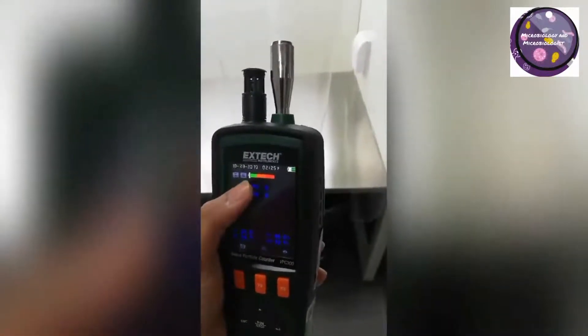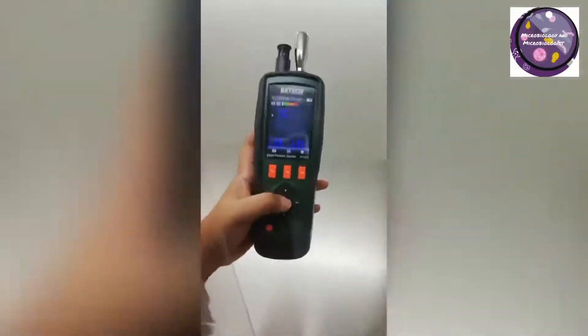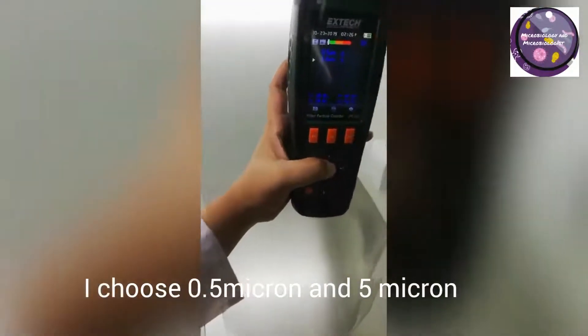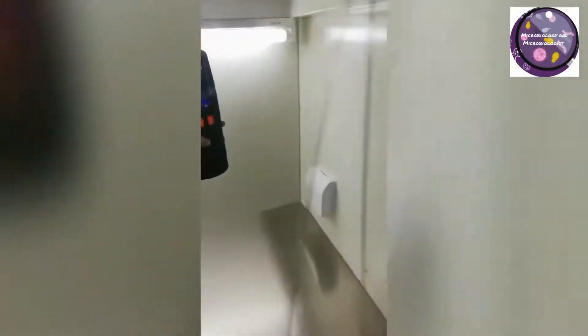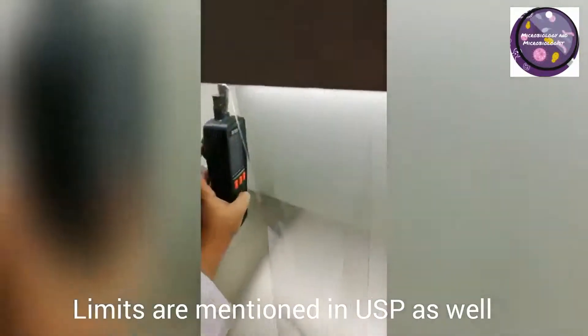Time and date are already set in the device and the particle sizes I have selected, as you can see on the display, are 0.5 micrometers and 5 microns. Those are very important particle sizes as already mentioned in USP <1116> chapter.